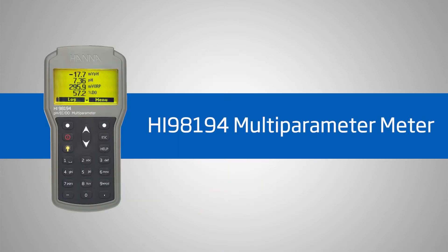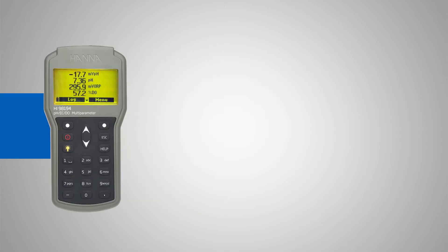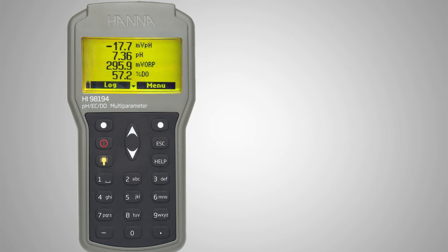Hi everyone, I'm Tiffany with Hanna Instruments and today we are going over our HI98194 Multi-Parameter Meter for environmental and water treatment professionals. This meter features a clear display with dedicated buttons for measurement, calibration, and unit selection. Powerful logging features and an easy calibration process make this meter a great tool for your water quality program. Hanna Instruments provides you with affordable and accurate equipment to help you achieve professional results.